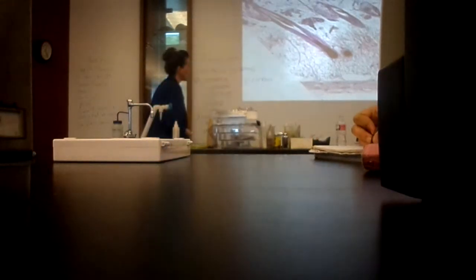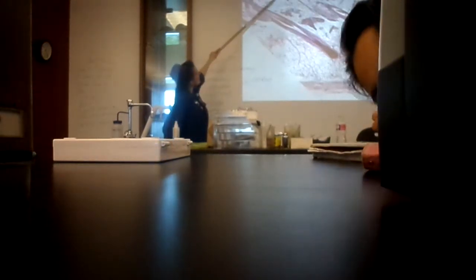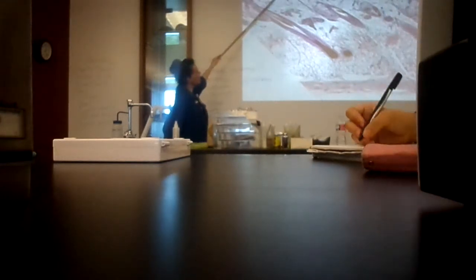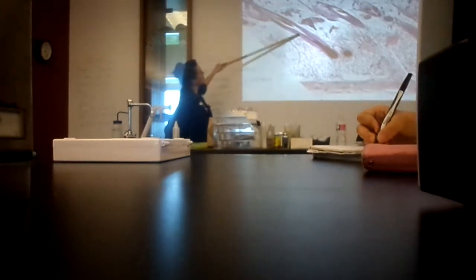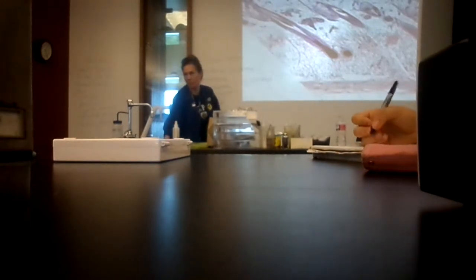3 layers of the skin. What do you think we call the most superficial layer of the skin? The epidermis. The epidermis is going to extend from this flaky layer down to just below that dark layer. I'm going to come up on higher power and look at it in a little more detail in a second. The middle layer of the skin, which is pretty much everything right in here, is called the dermis.